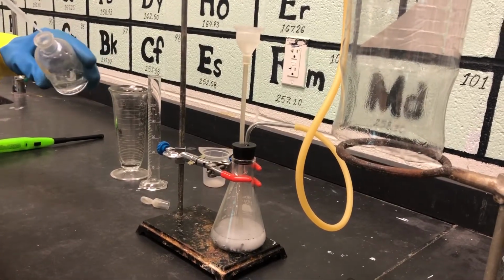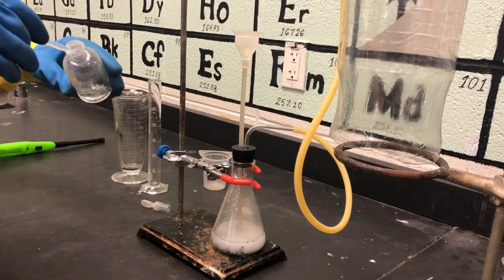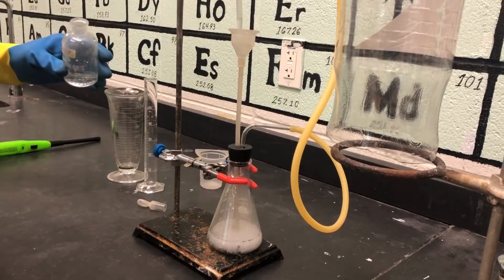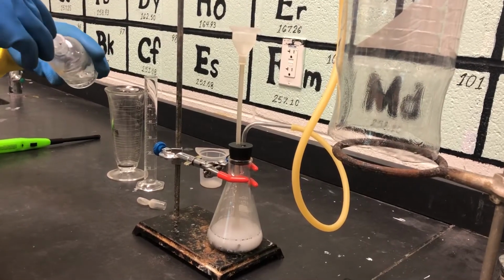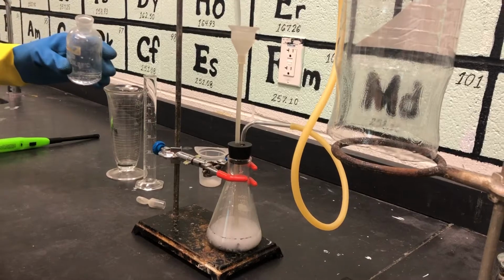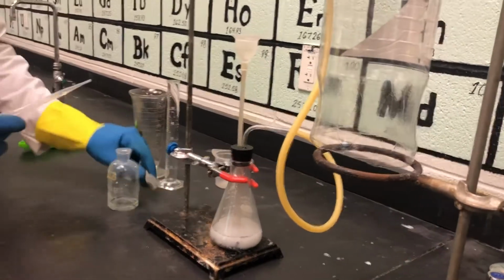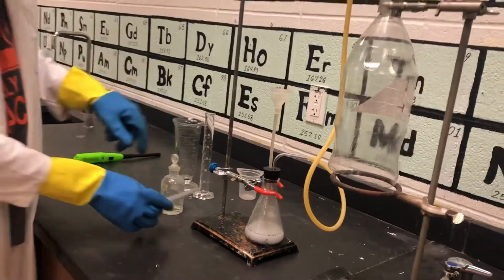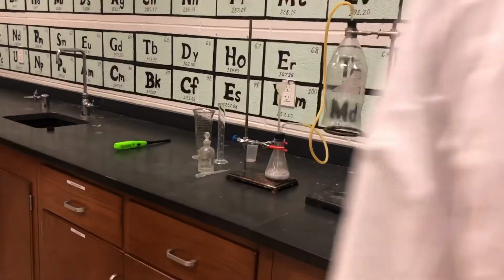So I'm going to continue to have a sustainable reaction here for a few minutes, okay? So I'm going to let that continue at one more, get a good reaction going. Give it about 5 minutes or so to continue, then we'll come back and run a test on it.